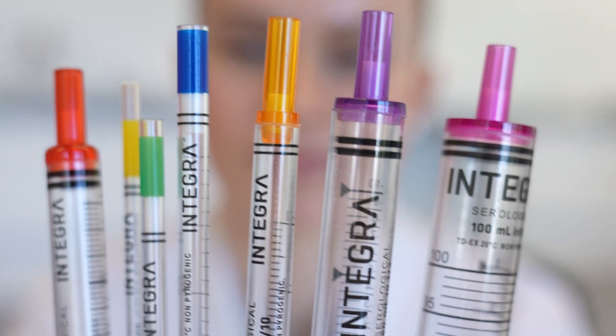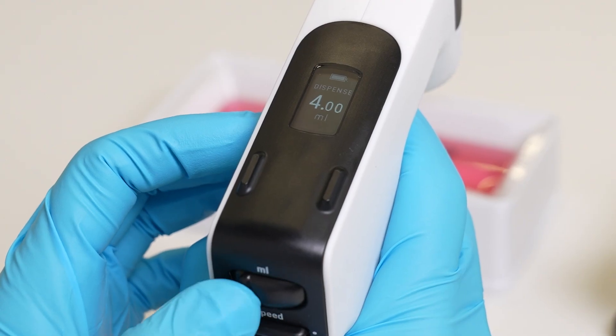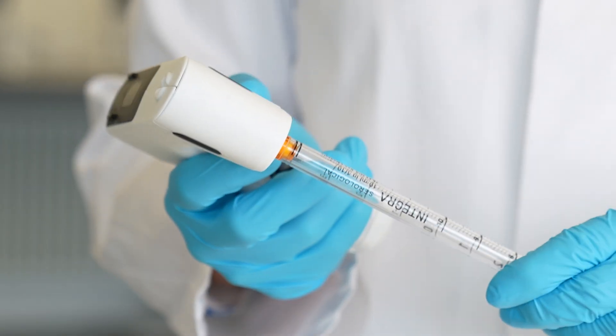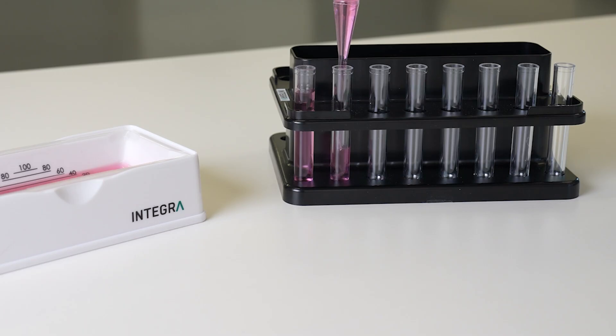Combining Integra's serological pipets with the PipetBoy Genius Pipet Controller brings the maximum value to improve your workflow. Combined, these offer an unparalleled blend of productivity and speed by enabling repeat dispensing and a unique overfill protection.